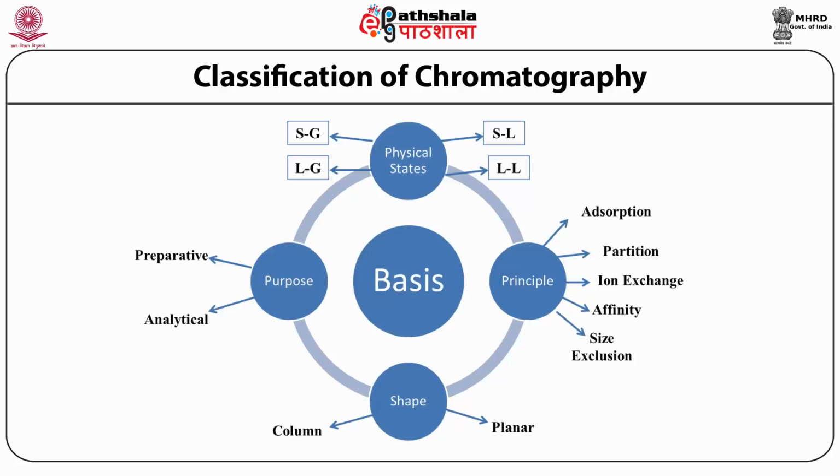When sample consisting of a mixture of proteins is passed through the column, only the specific antigen is bound to the antibody immobilized on the stationary phase. This antigen can be extracted either by changing the ionic strength or pH or through dialysis.